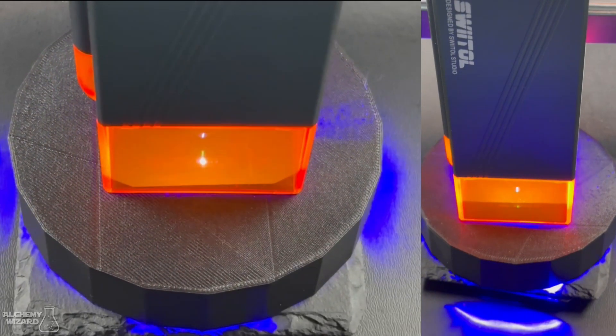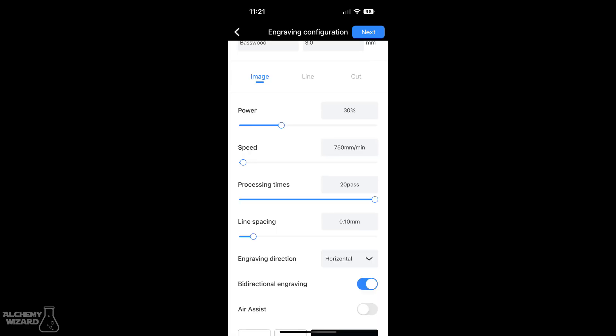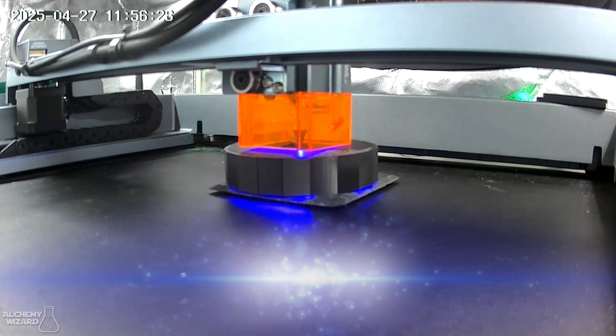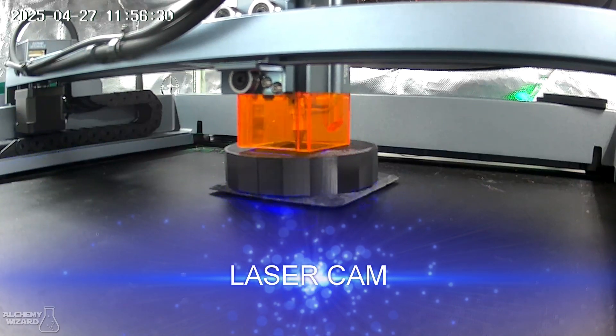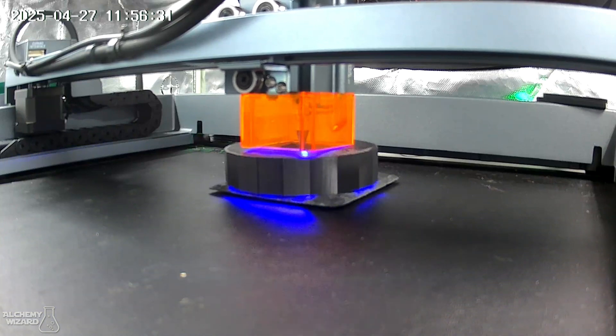Speed is important. Too slow will heat the material too much, causing loss of both nanoparticles and nanostars. According to the AI, we need a speed of around 600 to 1,000 millimeters per minute — I'm setting mine at 750, right in the middle range. I've already put the machine on and it's been making nanostars, hopefully like crazy. When it's done, I'll grab the sample, put it in the microscope, and examine the difference between where we started and where we ended up, comparing it to the plasma arc's spherical patterns.